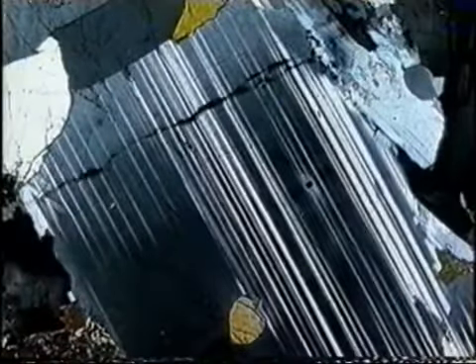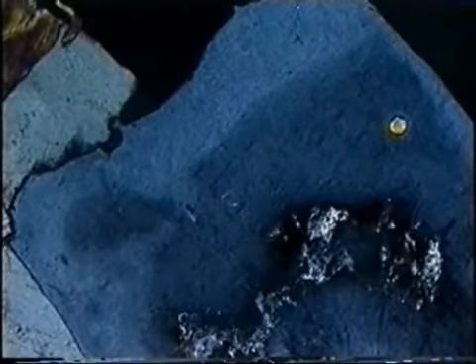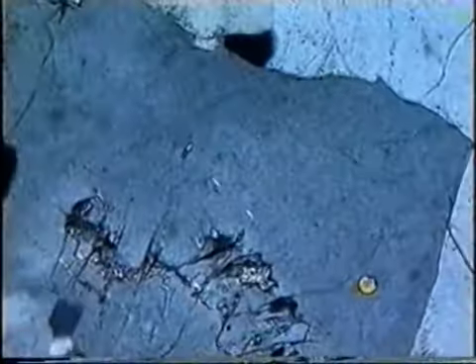Igneous plagioclase is commonly zoned, resulting in a range of extinction angles for a single grain. Here the extinction angle is less for the rim than the core, so the rim is more sodic. This is continuous normal zoning. Another example of normal zoning in untwinned plagioclase, showing different extinction positions for the rim and the core.